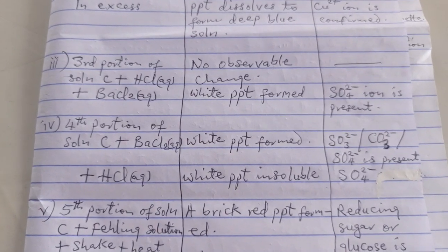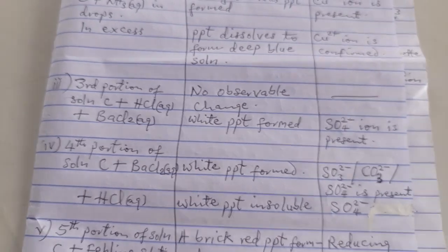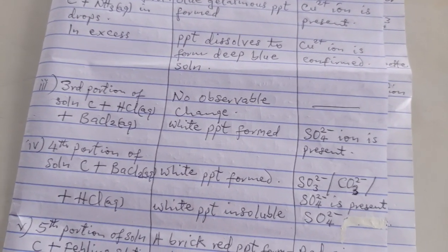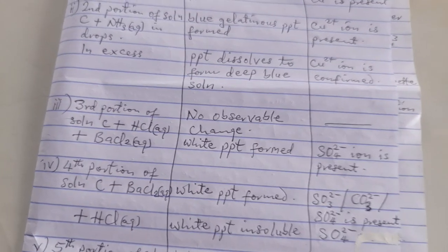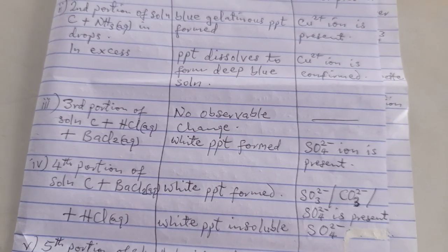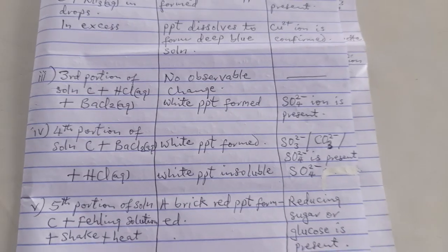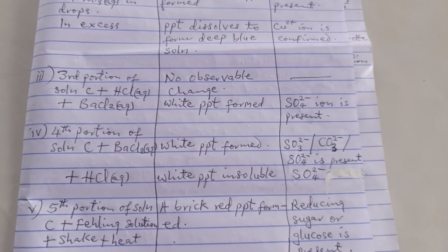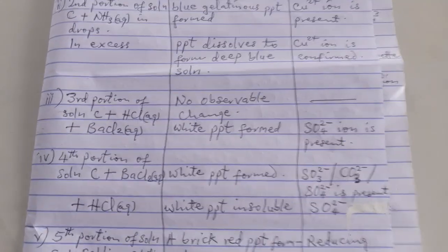Okay, now the third portion: plus dilute HCl. When you add that, no observable change. You won't see any change there. So when you add barium chloride, a white PPT will be formed. So when you see the white PPT formed, that means that SO42- is present. You have tested for the anion now.